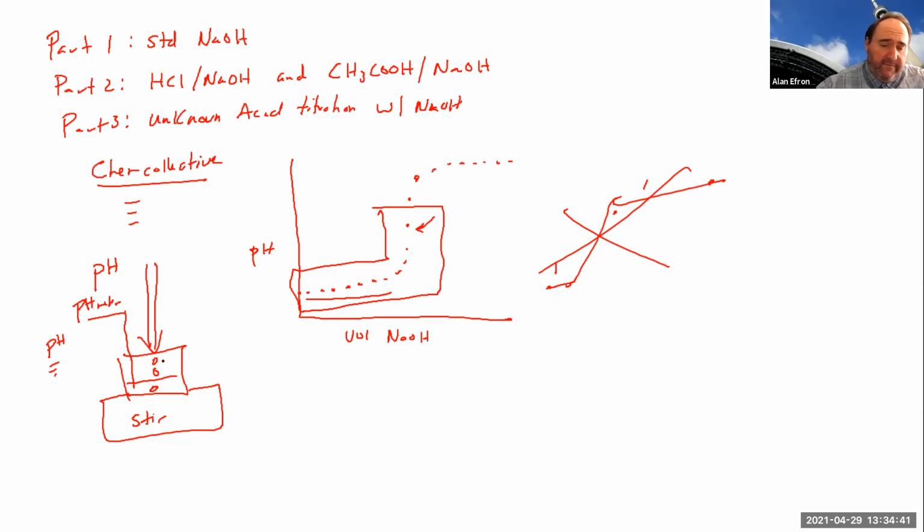And again, we're looking for very small pH movements here. As you're adding, you don't really want that pH to jump a lot, because your curve's not going to look really nice at the end and might not be analyzed as well. What you'll notice, and perhaps you'll even notice it as you're doing it on the Chem Collective as well, is that you do need to go slow, because as you approach that equivalence point, as we talked about, there's usually a fairly good jump in pH to that equivalence point, then a jump after the equivalence point, and then it levels out.